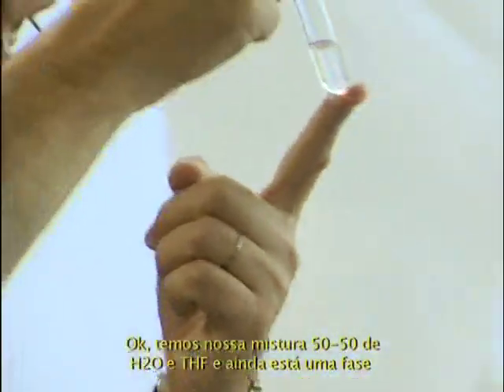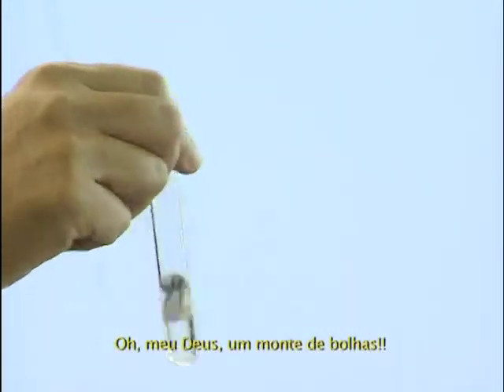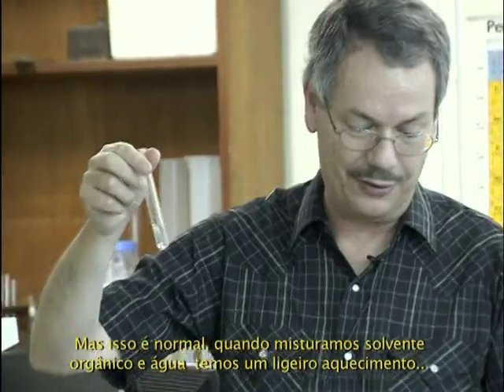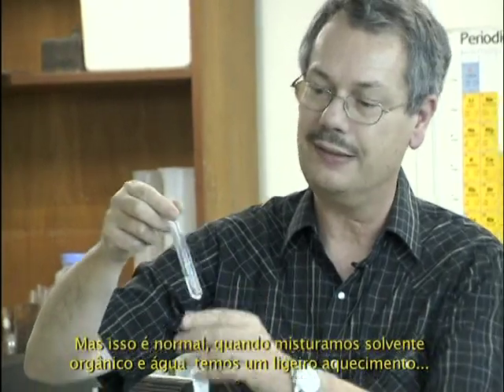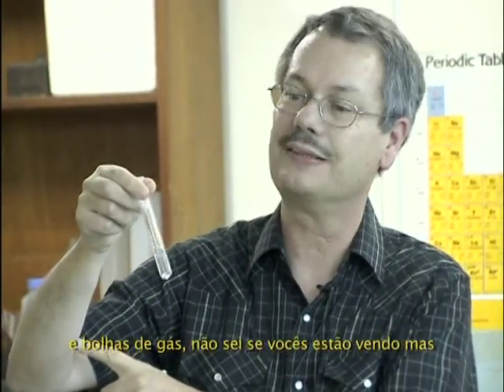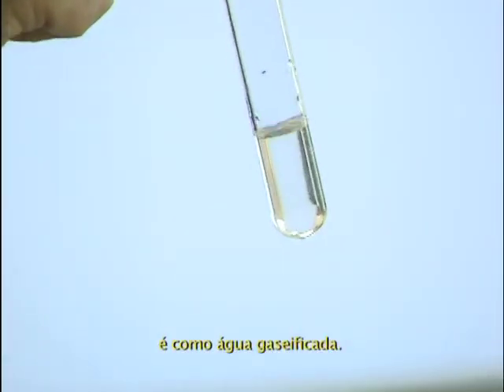I check, it's one phase. Oh my goodness, a lot of bubbles in there. So that's normal. When you mix organic solvent with water, you get a small heating and gas bubbles. I don't know if you see them, but it's like carbonated water.